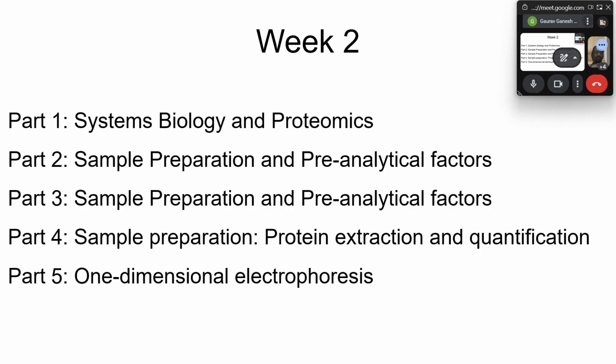Then we'll deal with what proteomics is, again a broad overview of proteomics. Then, as we are dealing with gel-based proteomics only, for that specific type of proteomics, we'll be dealing with how samples are prepared, how protein is extracted, how we can quantify that protein. And after that, one of the techniques, which is one-dimensional electrophoresis.